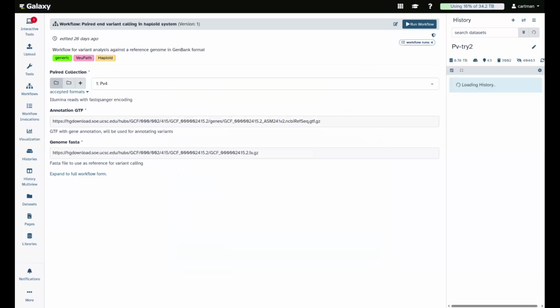So in Galaxy, you can run a complex workflow like the one that takes, for example, 1,400 datasets. At the end, it generates a list of variants. These lists of variants can be combined, so you get essentially a tab-delimited report file. And then you can do various things. One of the things that you can do is write custom visualizations.